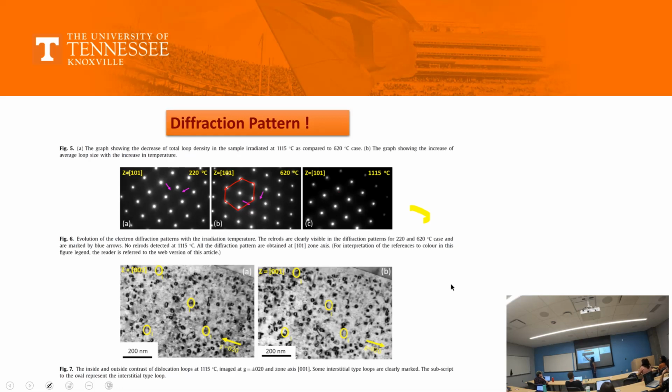And somebody would start joining a line here, here, here. So tell me, are these patterns the same to your eyes? I just want you to be familiar with the different zone axes.